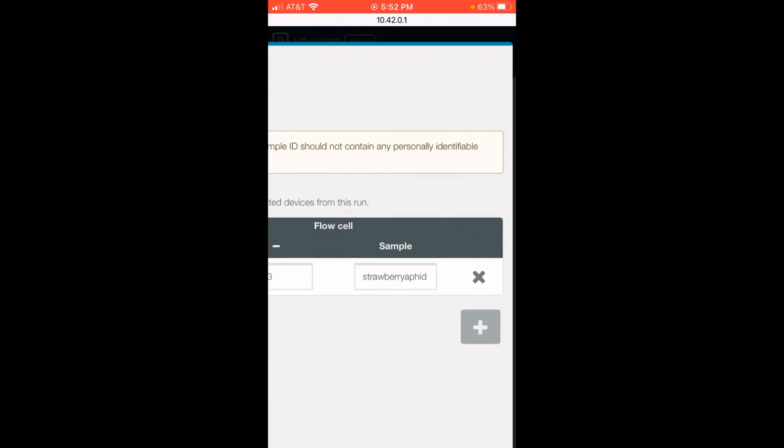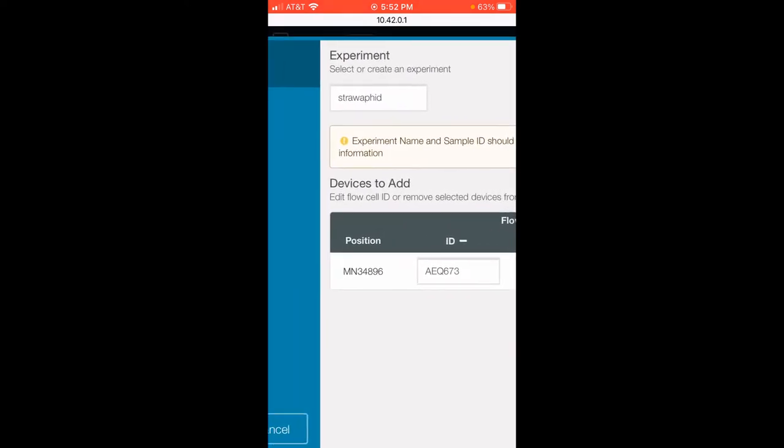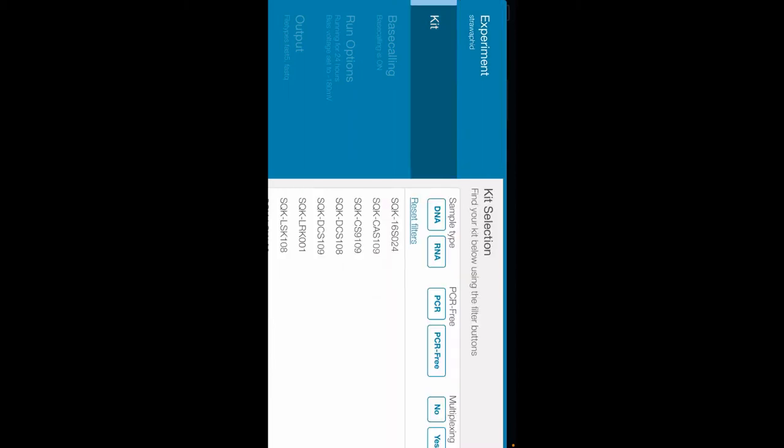And off to the left here, as I scroll, you'll see which kit are you using. We're using the field sequencing kit which is SQK-LRK001. Everything else we can go ahead and just use what would be the defaults there.